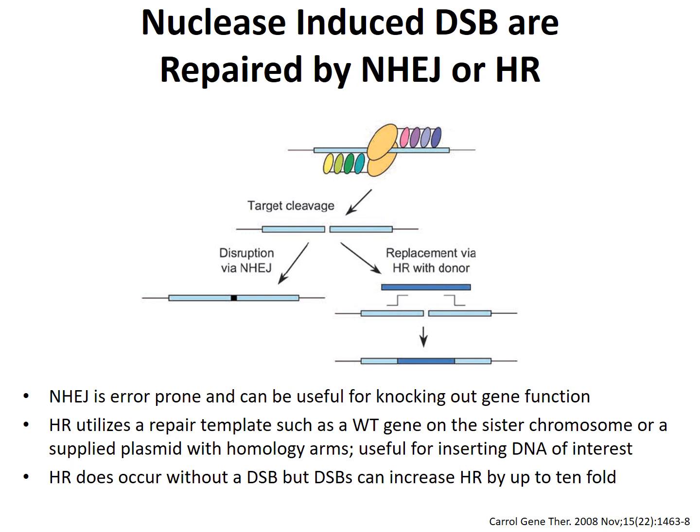The reason this is useful is because if we get an indel formed in a coding region of a gene, we can put that gene out of frame such that it can no longer make its protein, thereby knocking out the function of that gene. This will be the focus of Brian's portion of the talk: how to design CRISPR-Cas9 reagents to knock out genes in mammalian cells.